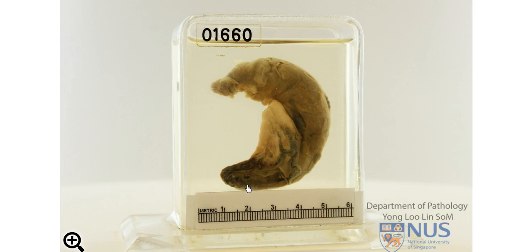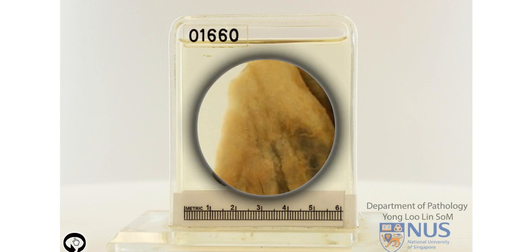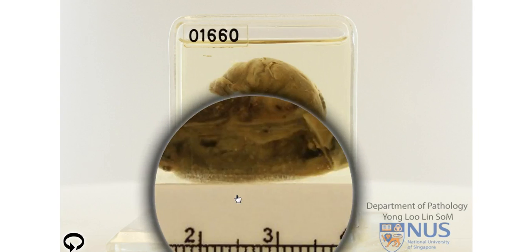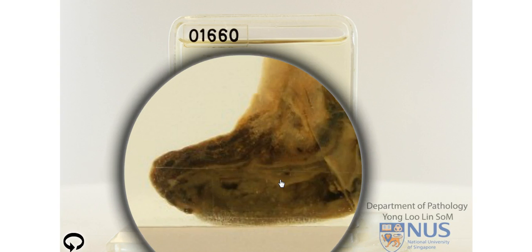Now looking at the tip of the appendix, we can appreciate that the colour is rather dark in the wall of the appendix, and this is due to congestion and hemorrhage. Let's take a closer look. Within the lumen, instead of seeing a very nice clean luminal surface, we are seeing this coating — in the fresh specimen it would appear yellowish-green. This is also purulent material which would be full of neutrophils, necrotic cellular debris, and sometimes even bacterial organisms.